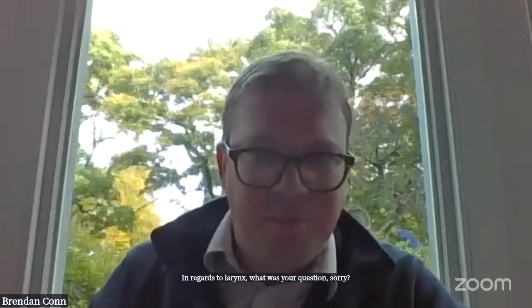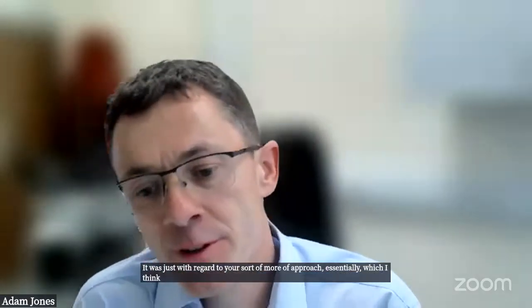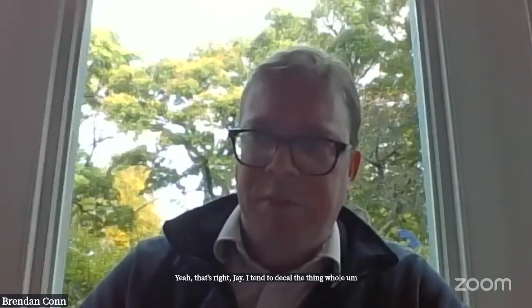With regard to larynx, what was your question, sorry? It was just with regard to your approach, essentially, which I think you've pretty much covered for all intents and purposes. Yeah, that's right. I tend to decal the thing whole. I'll return it if the anterior commissure is not completely decaled.